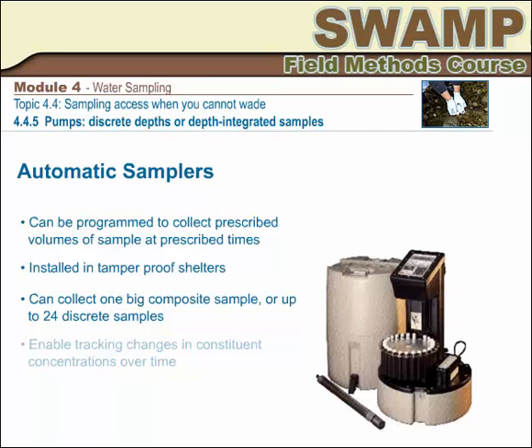The sampler end of the tubing often leads to one big common sample container that combines all pumped subsamples into a composite, for example, a flow-weighted composite. More advanced models also provide a rotating arm, which moves the sampler end of the tubing to fill discrete sample containers at given time intervals, thus allowing one to track changes in concentrations of a given analyte over time.